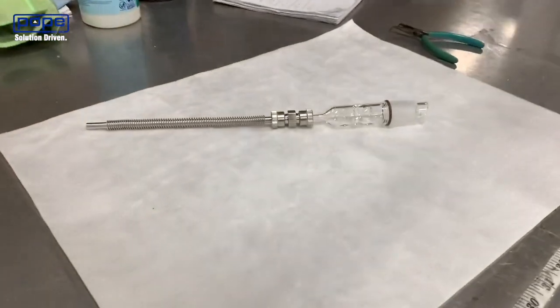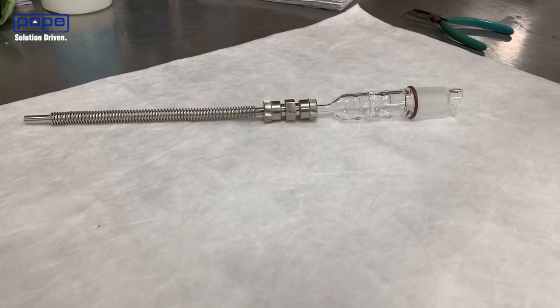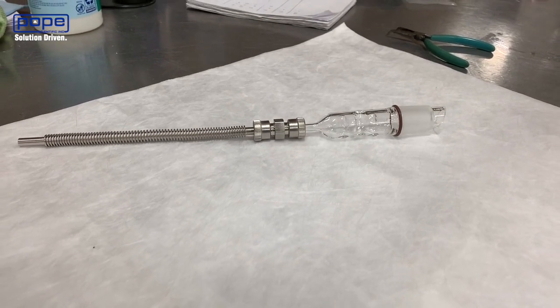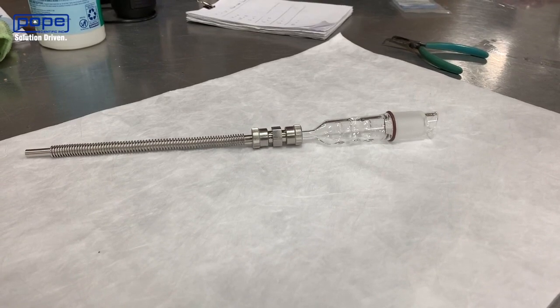Today we're going to be talking about an Ultra Torre fitting. We utilize these as one of our connections to go from metal to glass tubing. On the left hand side we've got a simple convoluted metal tube and on the right hand side we've got glass tubing.